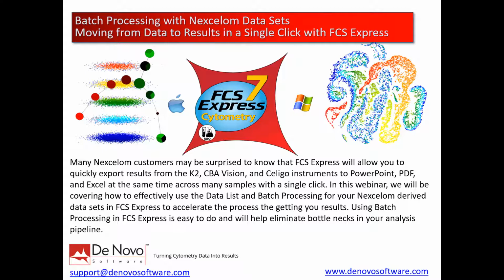Many Nexcelom customers may be surprised to know that FCS Express will allow you to quickly export results from the K2, CBA Vision, Celigo, and other instruments directly to PowerPoint, PDF, and Excel at the same time across many samples with a single click. In this webinar, we will be covering how to effectively use the data list and batch processing for your Nexcelom derived datasets in FCS Express to accelerate the process to getting you results.